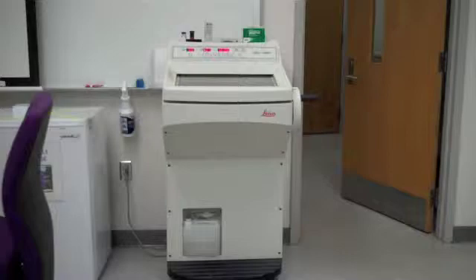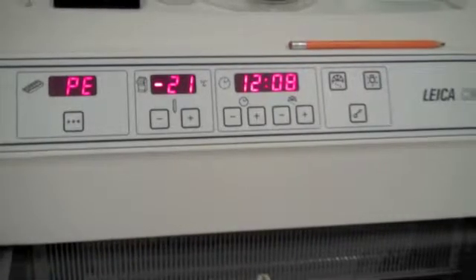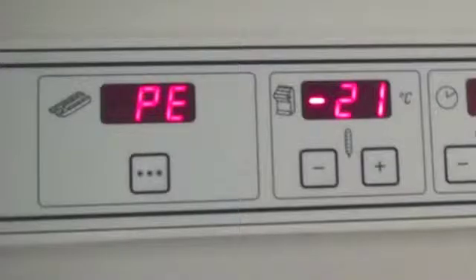This is the cryostat used in our lab to section zebrafish embryos and tadpoles. This is the control panel. This is the deep freeze button. When pressed, it dramatically cools the deep freeze bar inside the cryostat.